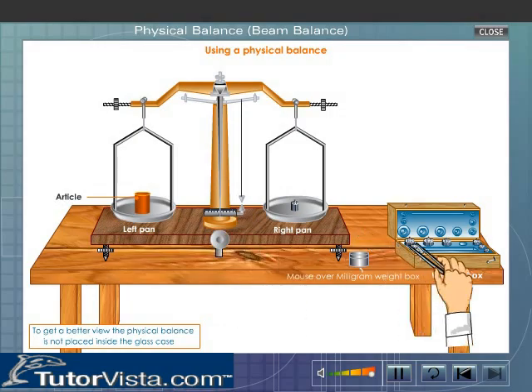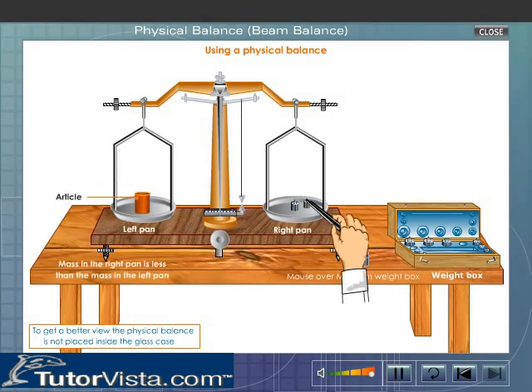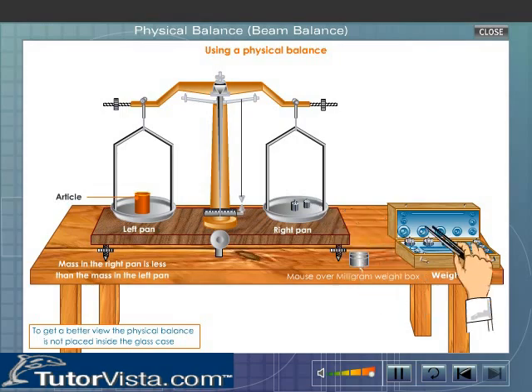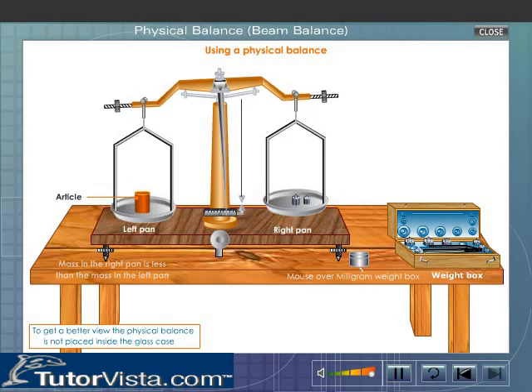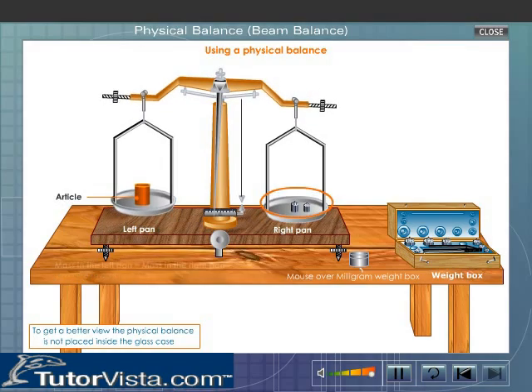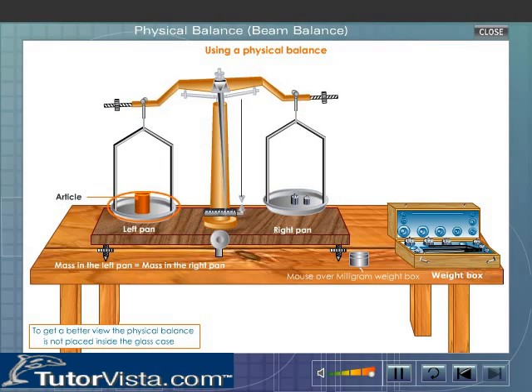Record the mass placed in the right hand side pan. This is equal to the mass of the body on the left hand side pan.